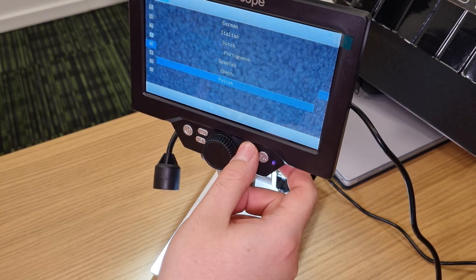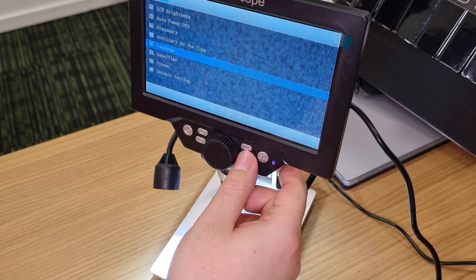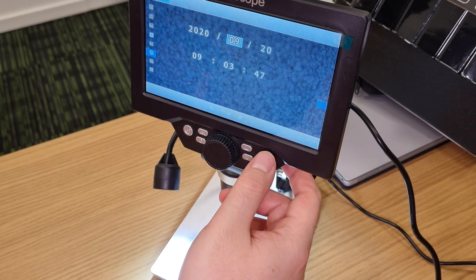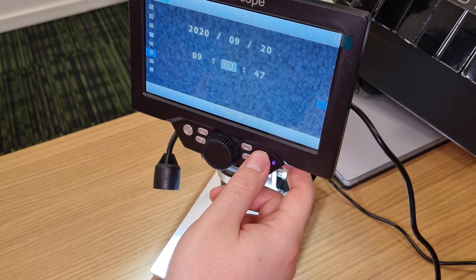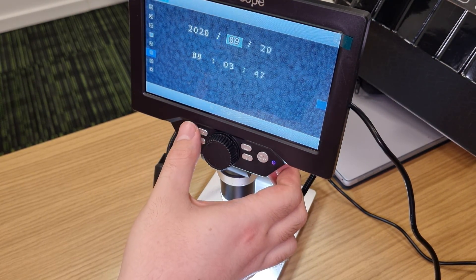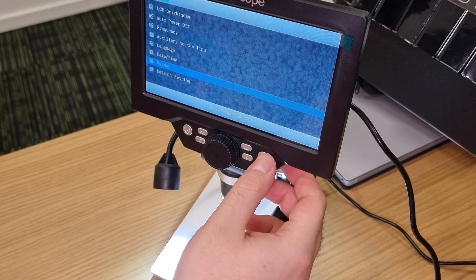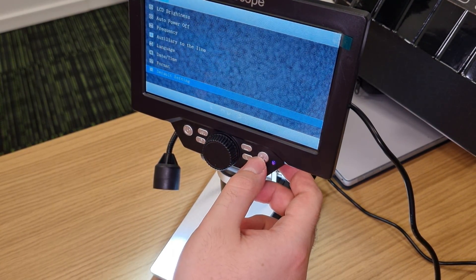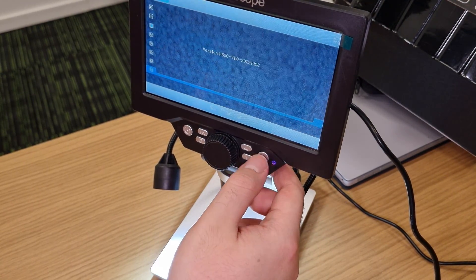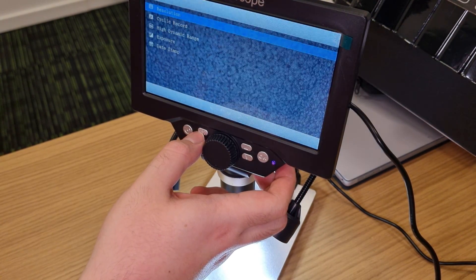The translation is pretty good, I didn't expect that. There's even Polish! But let's go back to English. There's time and date settings, SD card formatting, an about screen showing firmware version, and default settings. That's all the options — nothing extra needed.